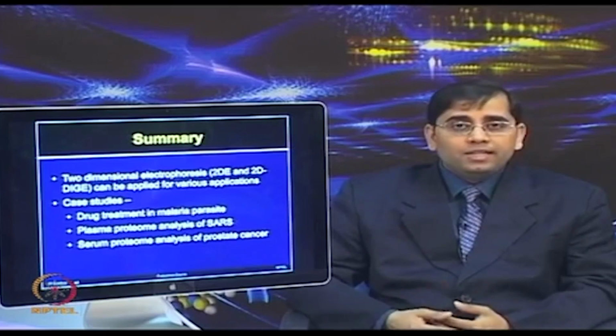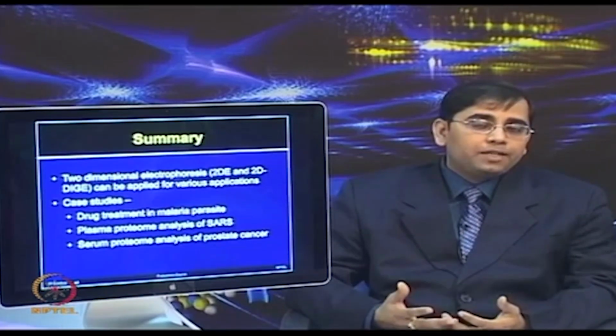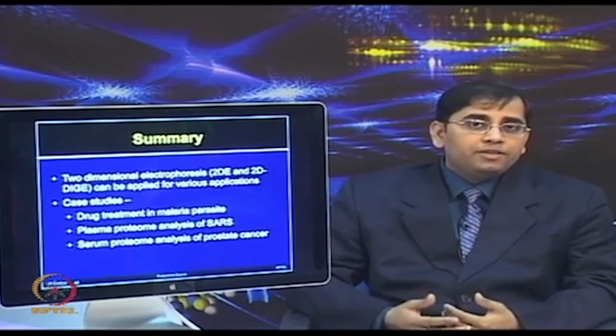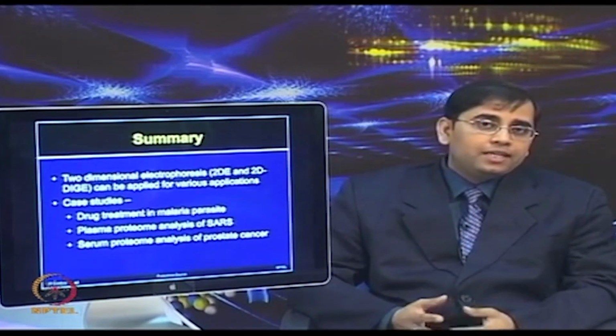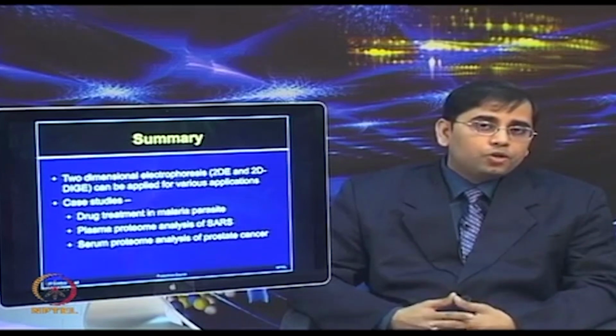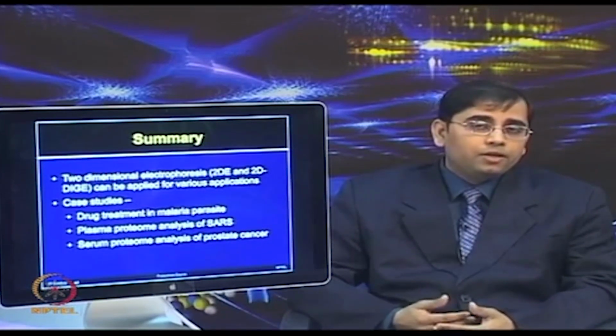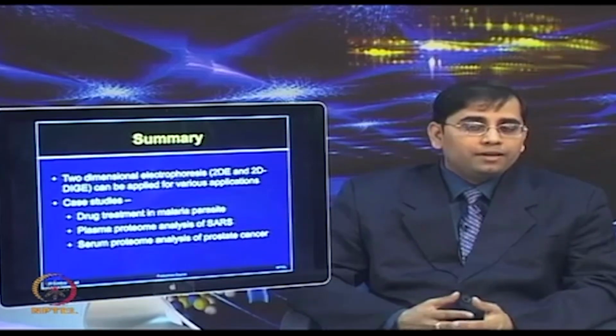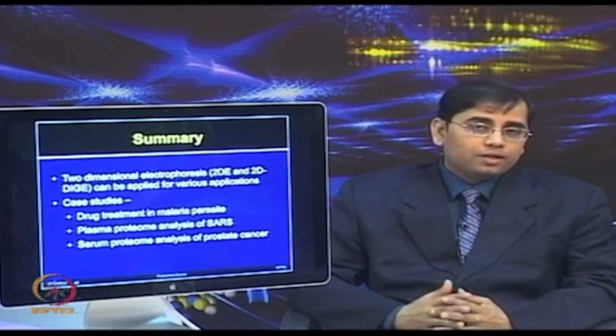But how many proteins you can establish as differentially expressed is the major discriminator between these 2 techniques. You might lose a lot of significant spots by using only conventional proteomic analysis, because you have to apply a large number of gels for those comparisons.